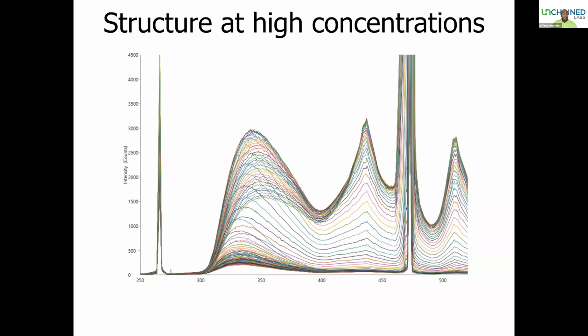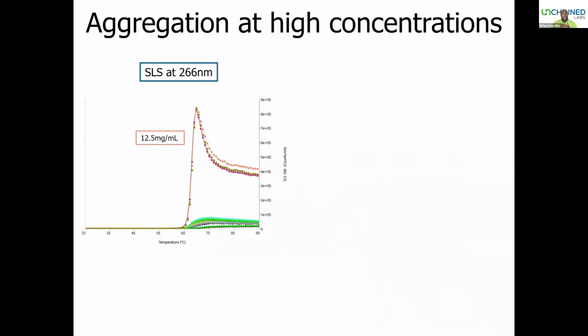So it's a rather interesting way to look at it. Another way to think of this is that if I were to overlay the actual curve of the samples for the aggregation itself, right? If you recall, aggregation is simply a look at the intensity as a function of temperature. And so presumably the more aggregated you are, the larger your particles are, and therefore the more light they should scatter. And also the higher the concentration, the more light you should scatter.